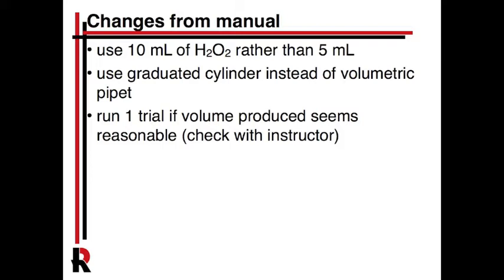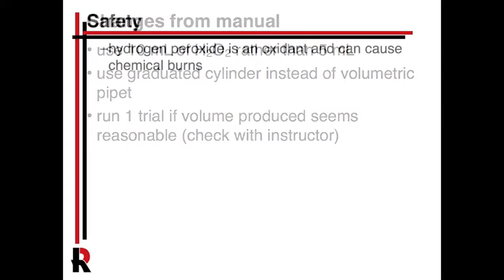There are certain numbers you expect this to produce, and if you're off because the system's not quite set up right, then maybe you can repeat it. But I think 1 trial is usually sufficient to get good data that you can work with.